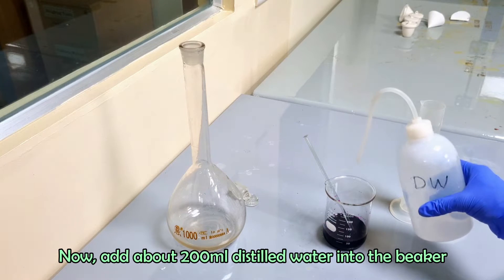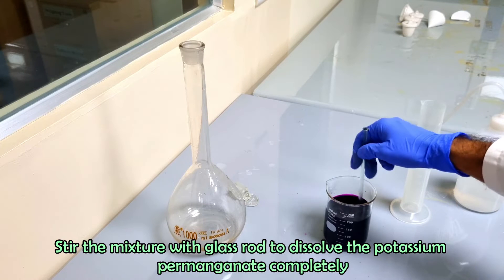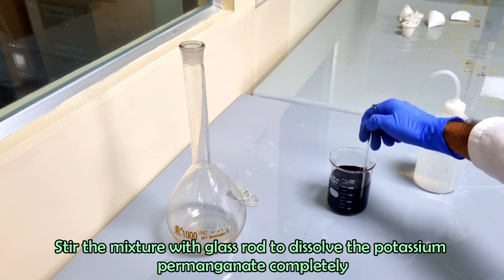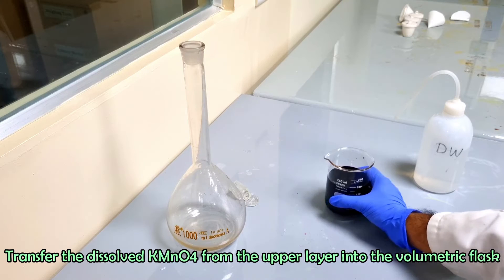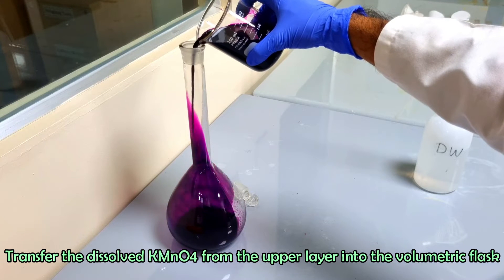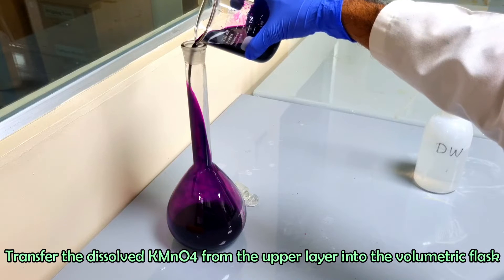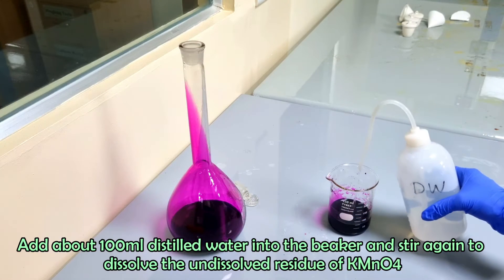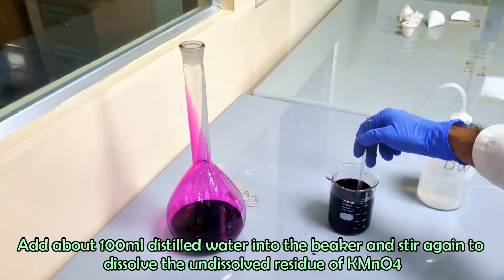Add 200 ml of distilled water into the beaker. Stir the mixture with a glass rod to dissolve the potassium permanganate completely. Transfer the dissolved potassium permanganate from the upper layer solution of the beaker into a volumetric flask. Add about 100 ml of distilled water into the beaker and stir again to dissolve the undissolved residue.